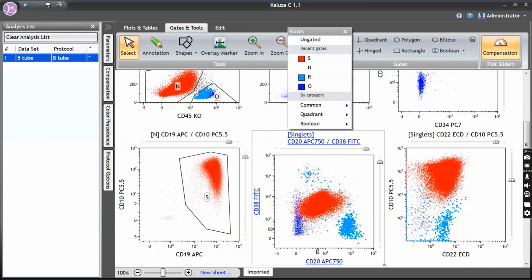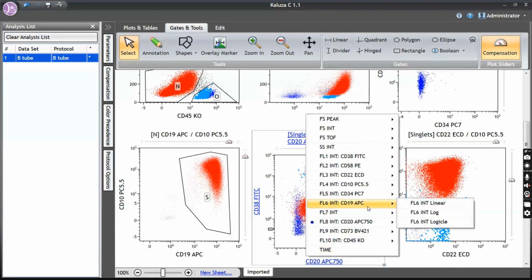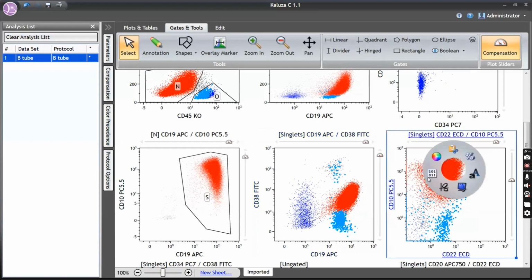It's between the positive and the negative population. So I will happily label them as dim expression for CD20. So we have internal plasma cells as a positive control here. Plasma cells are bright positive for CD38. Now what is the expression? Since I'll put it with another marker, something like CD19, what do you feel the CD38 expression is here for the blast? This is the normal internal positive control, which is bright. Moderate to dim. Agreed? Super.